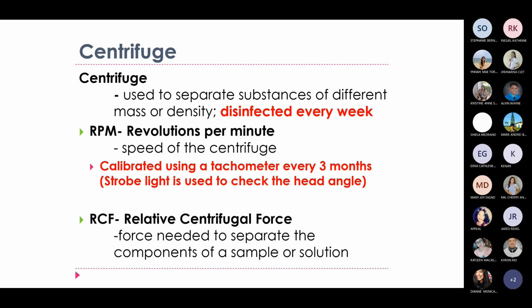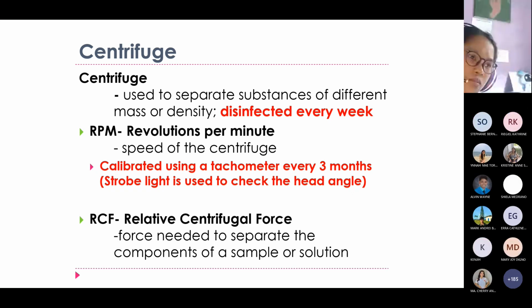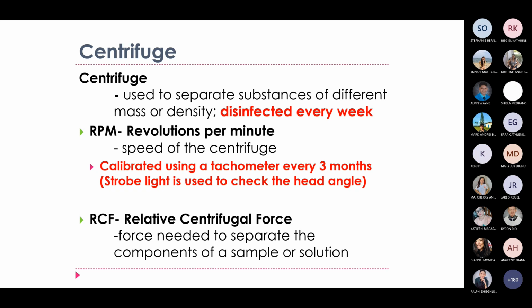Okay, the important tool in laboratory. So one tool is the centrifuge. So the centrifuge is used to separate substances. Lalo na sa mga nakapag-intern na dyan, mas hands-on na kayo nakakapag-operate ng centrifuge. And our centrifuge is disinfected every week ha. Weekly ang disinfection dapat ng centrifuge. Ayan na, naka-bold na, naka-highlight pa.